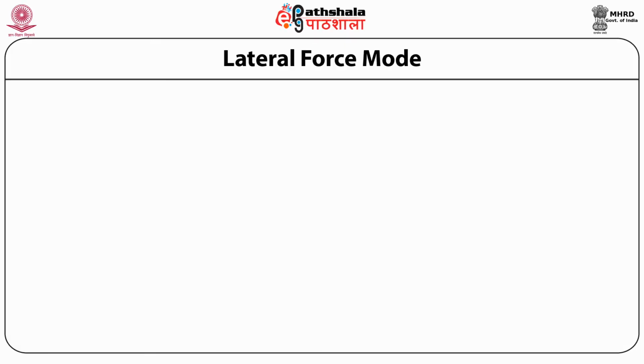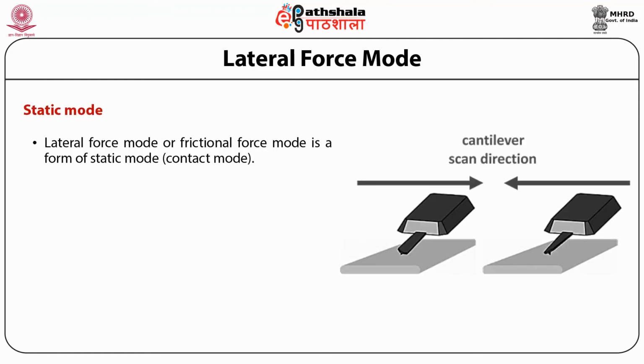Let us now discuss the lateral force mode. This mode, or the frictional force mode, is a form of static or contact mode. In this type of mode, the imaging is exactly as it is in the static mode, except for the cantilever scanning motion, which is generally performed perpendicular to the axis of the cantilever as opposed to a freedom of scan rotation for conventional static mode. The schematic of lateral force mode scan configuration is shown in this figure.